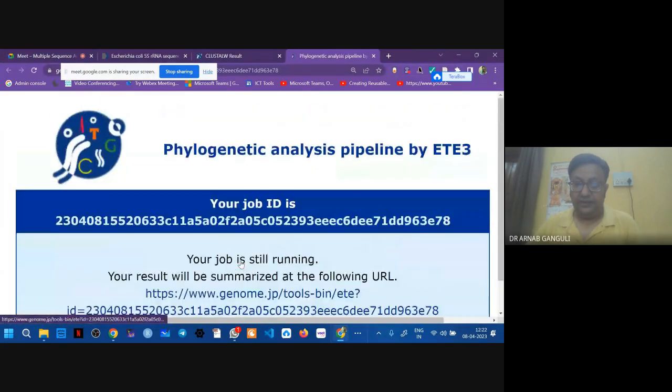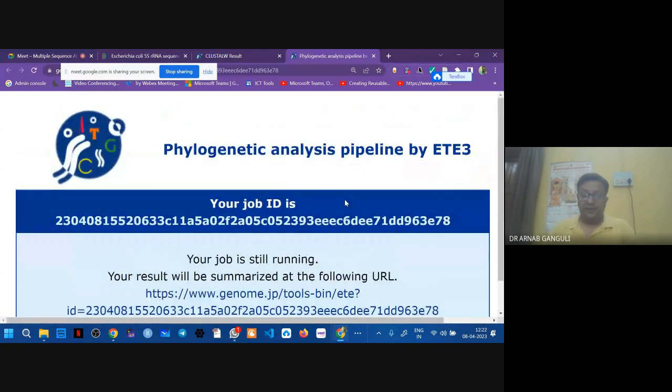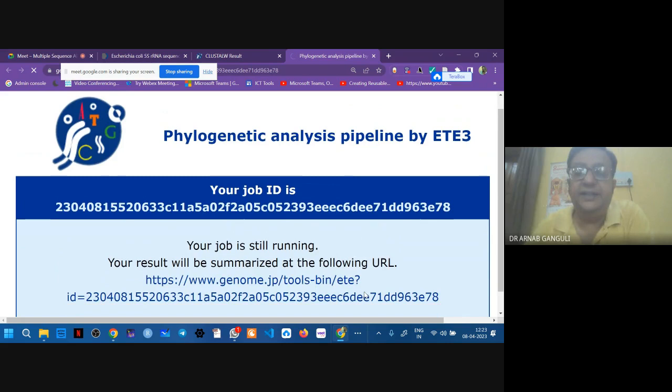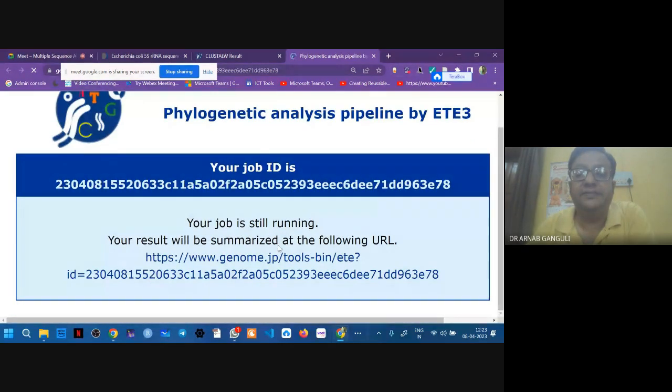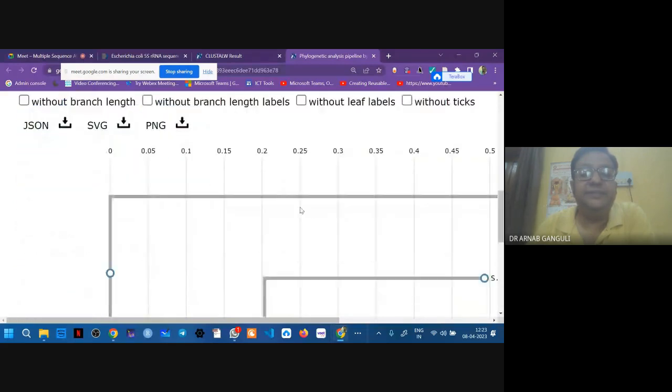Job is still running. Wait for some time, it's still running. Here, the result has come.